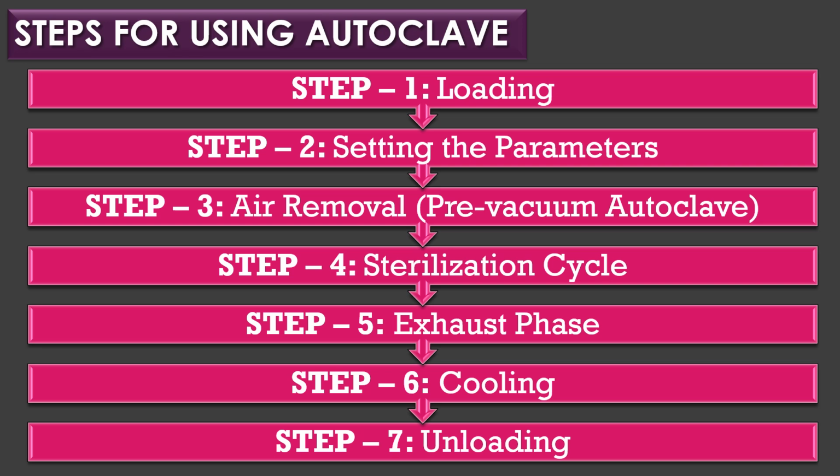The sixth step is cooling. Allow the contents to cool down before opening the chamber to prevent burns or contamination. Finally, step 7 is unloading. Finally, remove the sterilized materials.